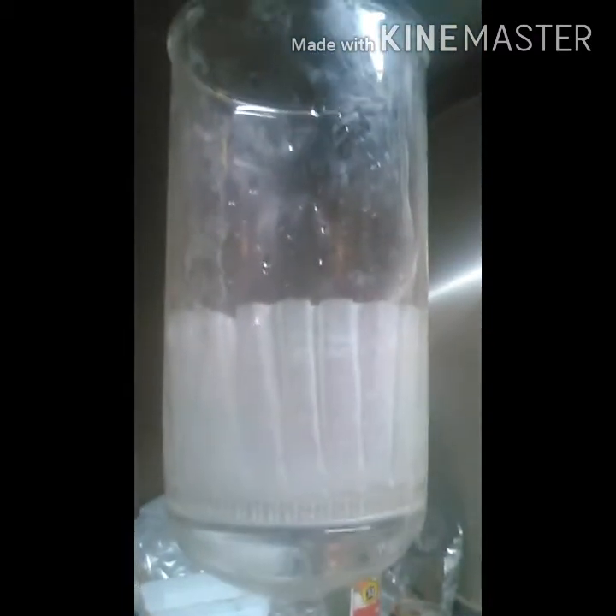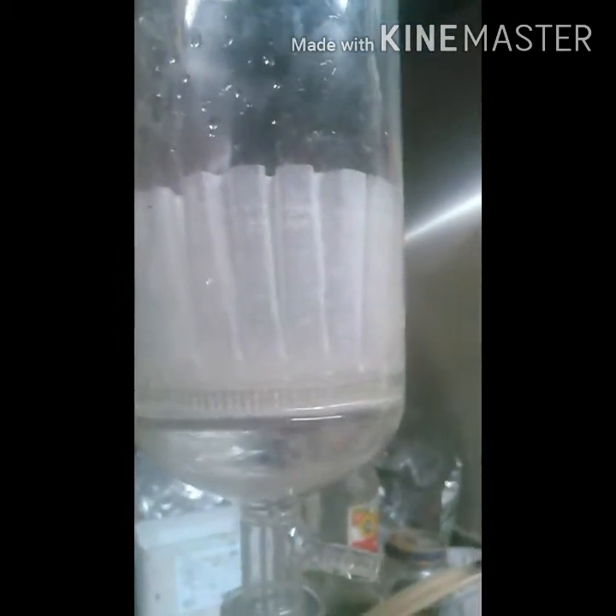I got my first filtration done. Then I took my lidocaine and added it to a bunch of distilled water, and now I'm going to vacuum filter this again. When I get done with that, I'll be back.